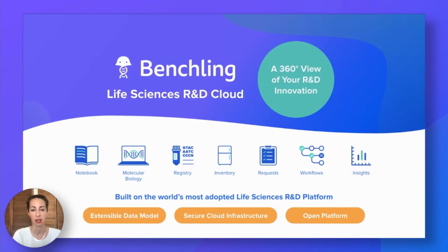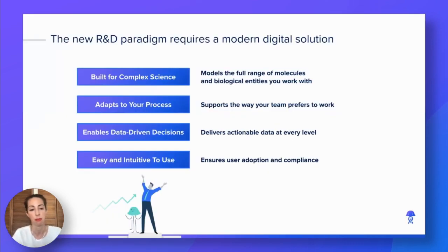We offer 7 integrated applications in a single interface, and these applications span the R&D process from experimental design, in silico biology, sample tracking, and process management. These applications are built on a common platform and configurable data model to support each team's unique requirements. We think that every company and scientific team deserves a solution that will accelerate and support their innovations.